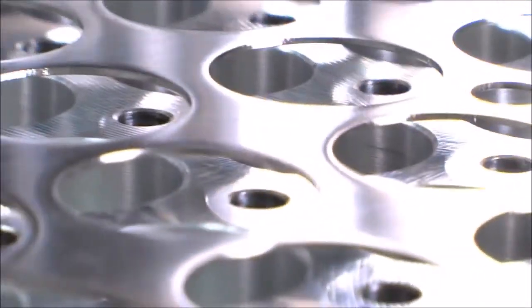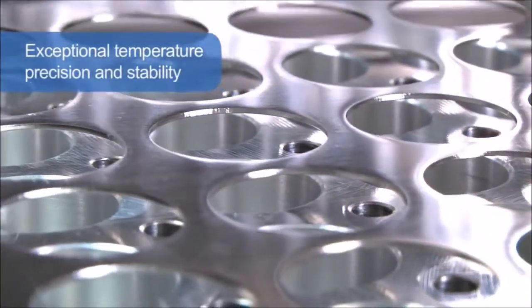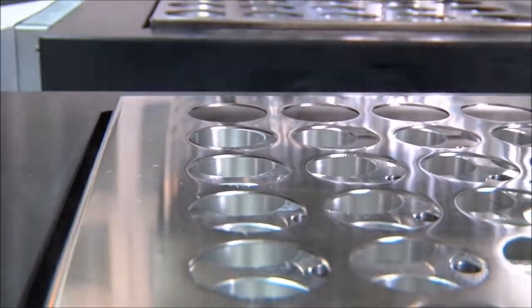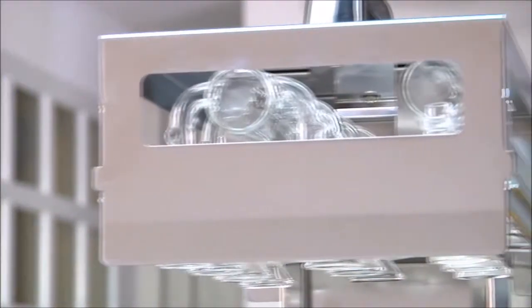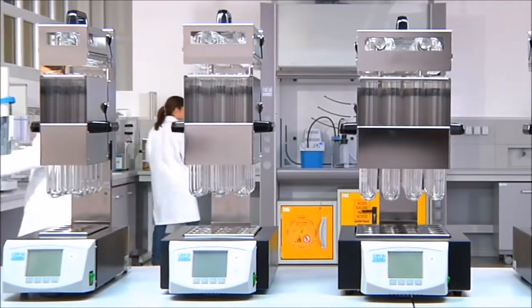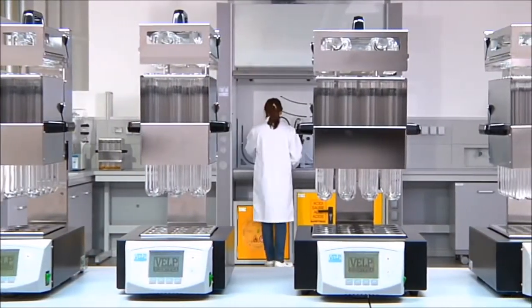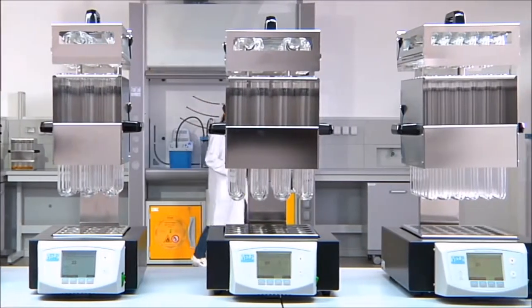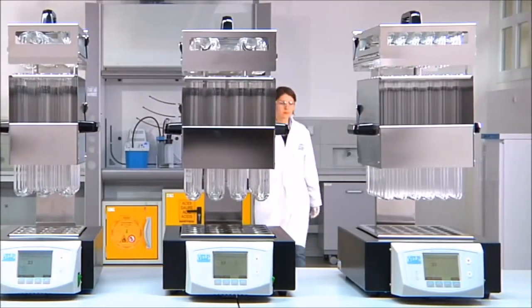The DKL series offers exceptional temperature precision and stability, only plus or minus 0.5 degrees centigrade for all the samples, allowing complete and homogeneous digestion and covering a temperature range from ambient to 450 degrees centigrade. Units accept 8 standard 250 ml, 12 250 to 400 ml, 20 250 ml or 42 100 ml digestion tubes.